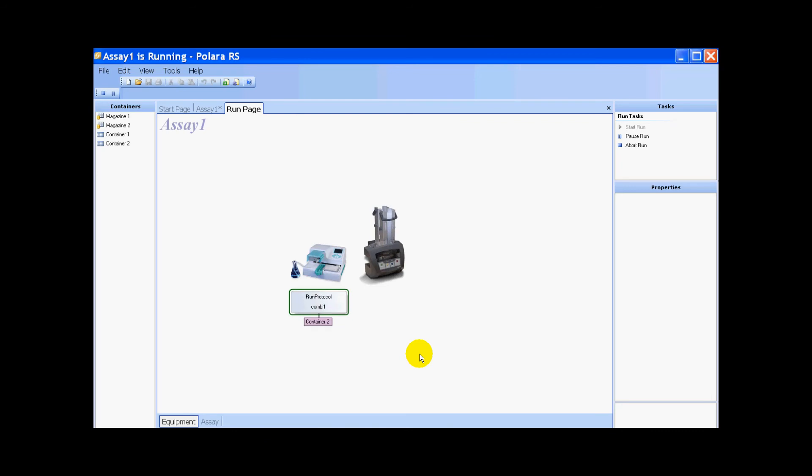Again, you'll see this when we go into the live shot. It's priming, running protocol, priming, priming again, and running reagent two.